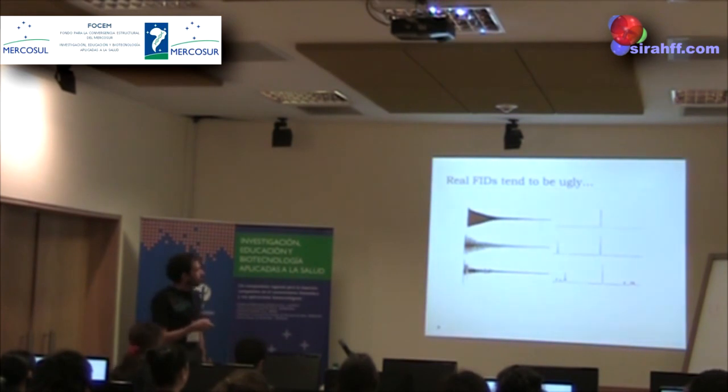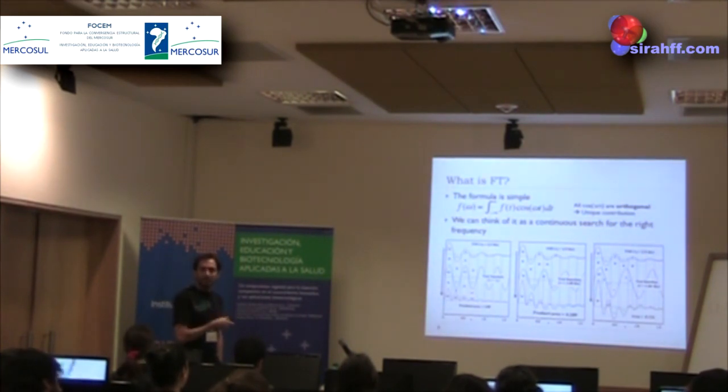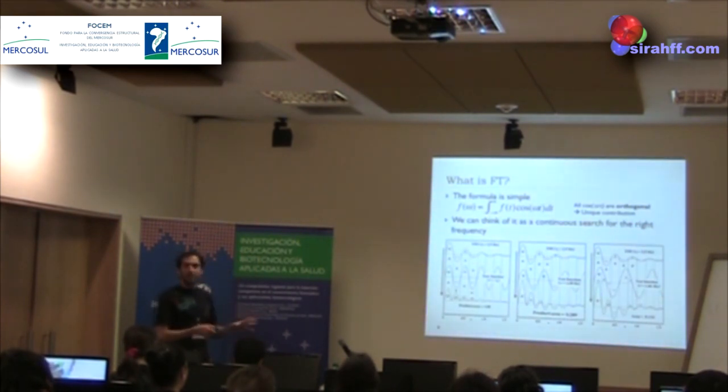And how does FT, that is magic, work? I have a different way of... actually, Fourier transforms are very simple. Okay? The formula for a Fourier transform is this one.